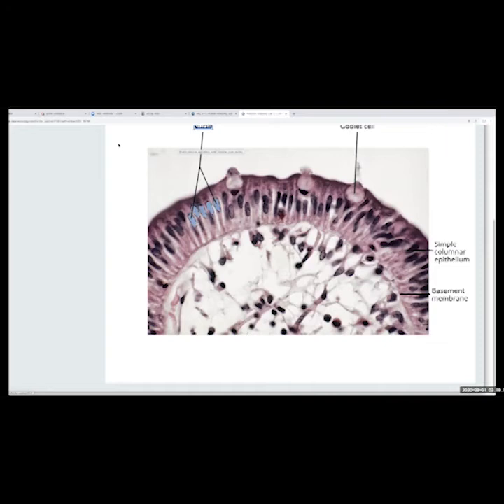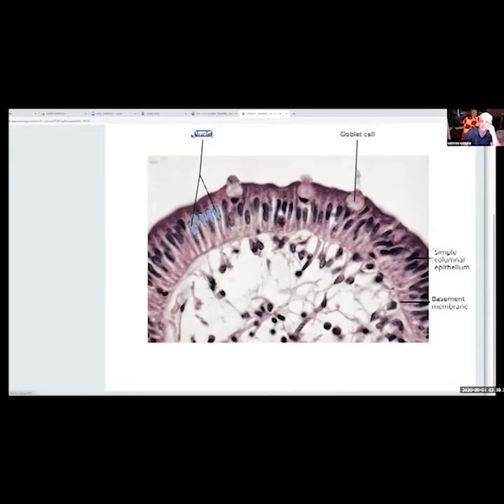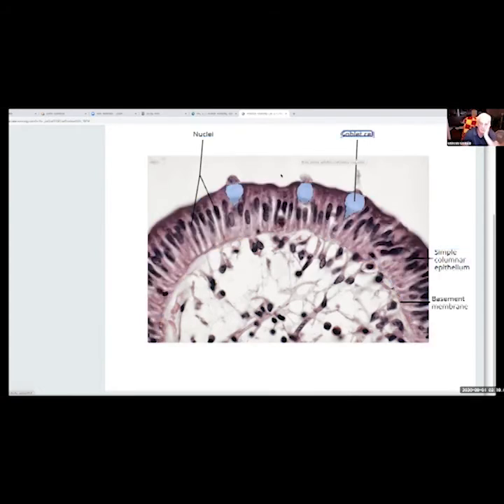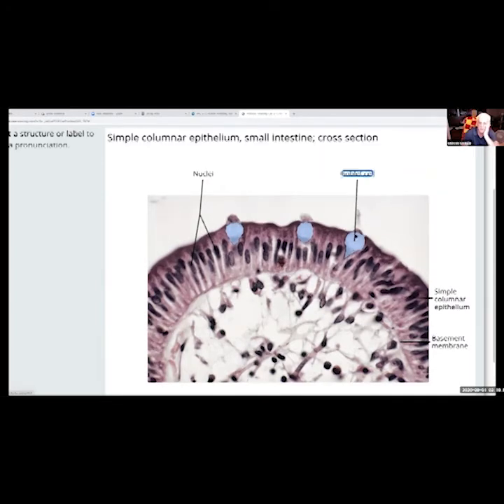Is the goblet cell exploding? Why is it looking like that? Goblet cells excrete. Is this the stomach one? Yeah, small intestine. Goblet cells excrete mucus, and you can see something being excreted up in these areas right in here, into the intestine. Those excrete different materials and help with digestion. We'll get into goblet cells and what they excrete when we do the digestive tract. But it looks like this could be an excretion from it, or it could just be an image from that three-dimensional cut.